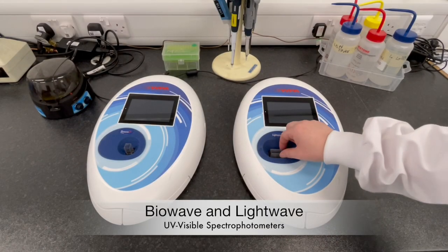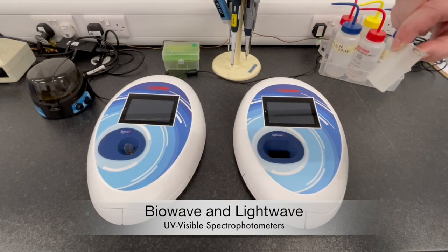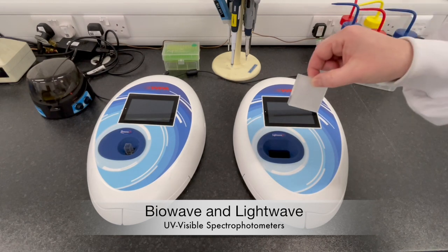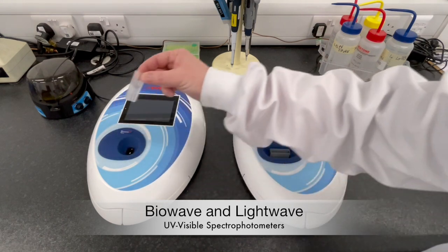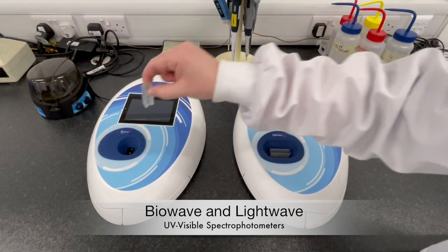With a range of 190 to 1100 nanometers, the WPA family of UV visible spectrophotometers from Biochrom includes the LightWave and BioWave instruments for flexibility no matter what your sample.